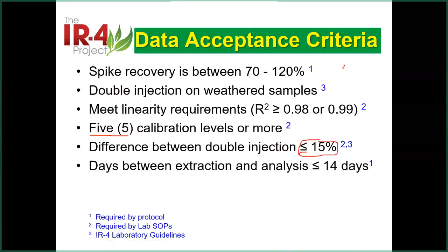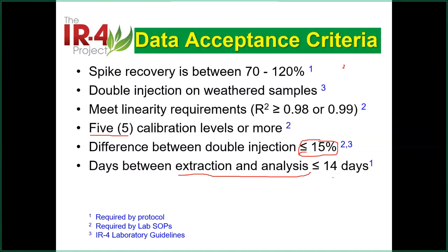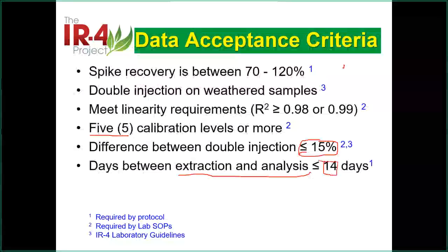The next criterion is the date, the holding time. So your extract, this is mandatory. This is not science. Between extraction and analysis, we put 14 days there. We don't want it to wait too long because things will change.